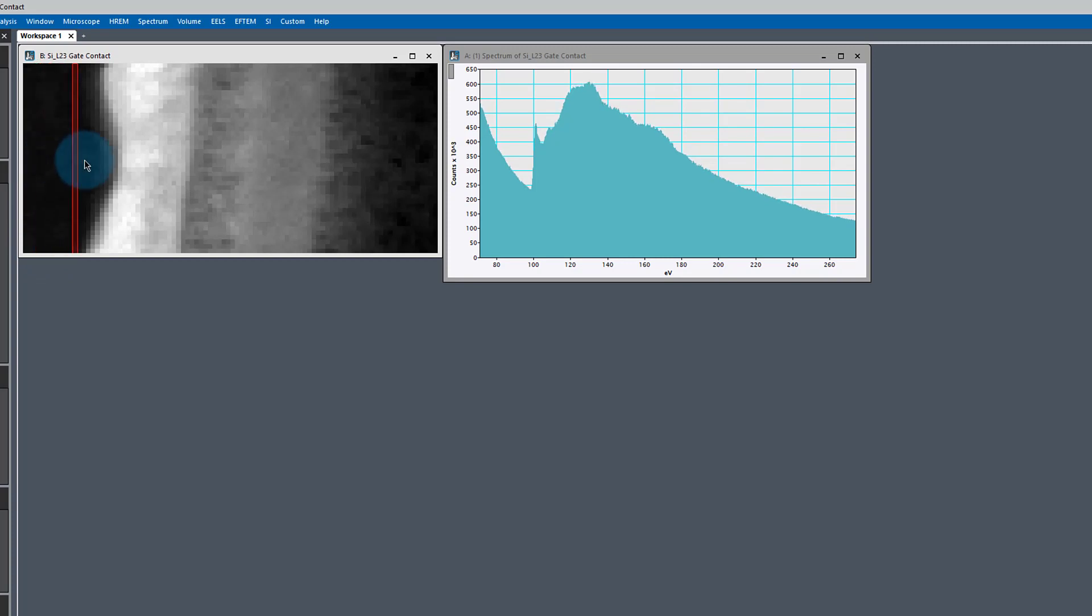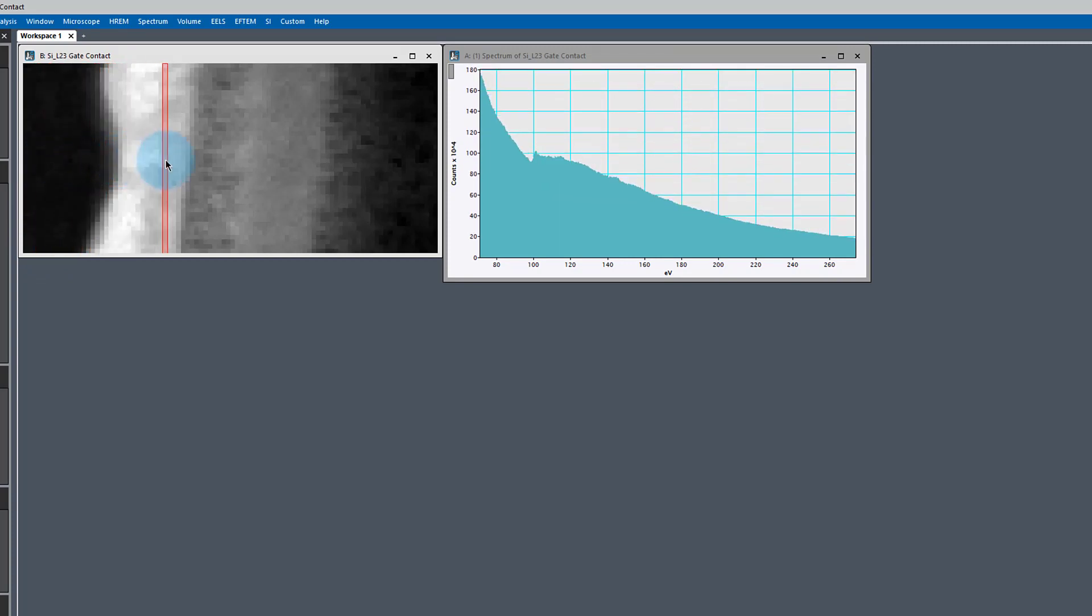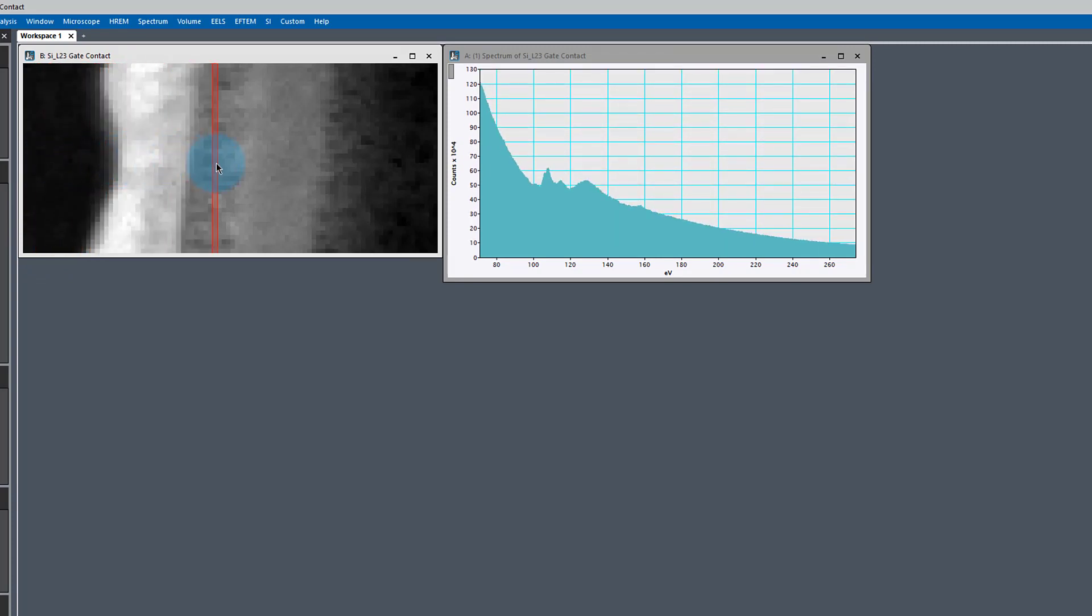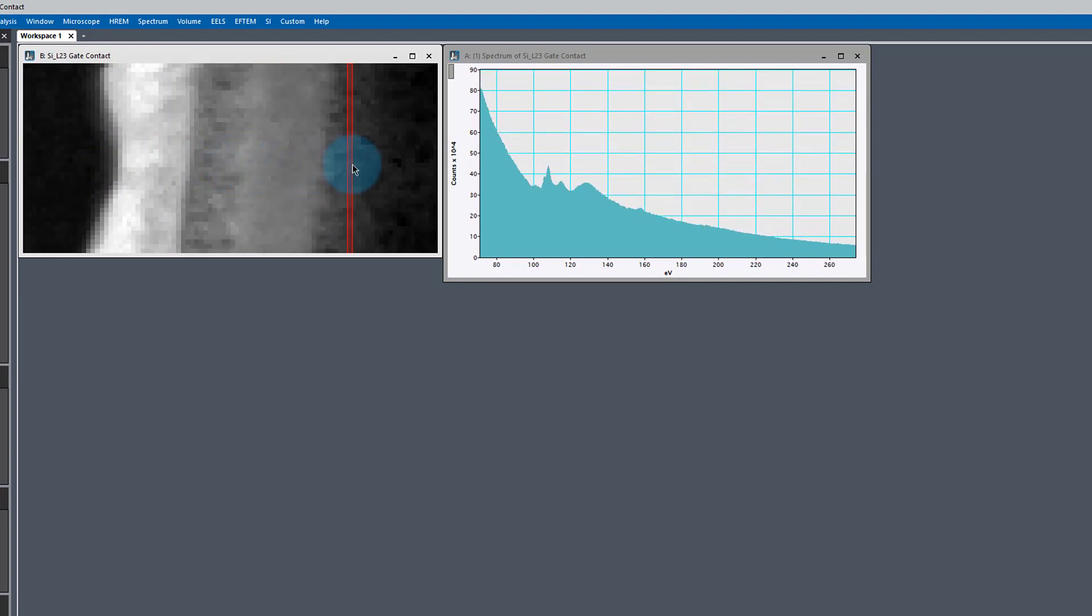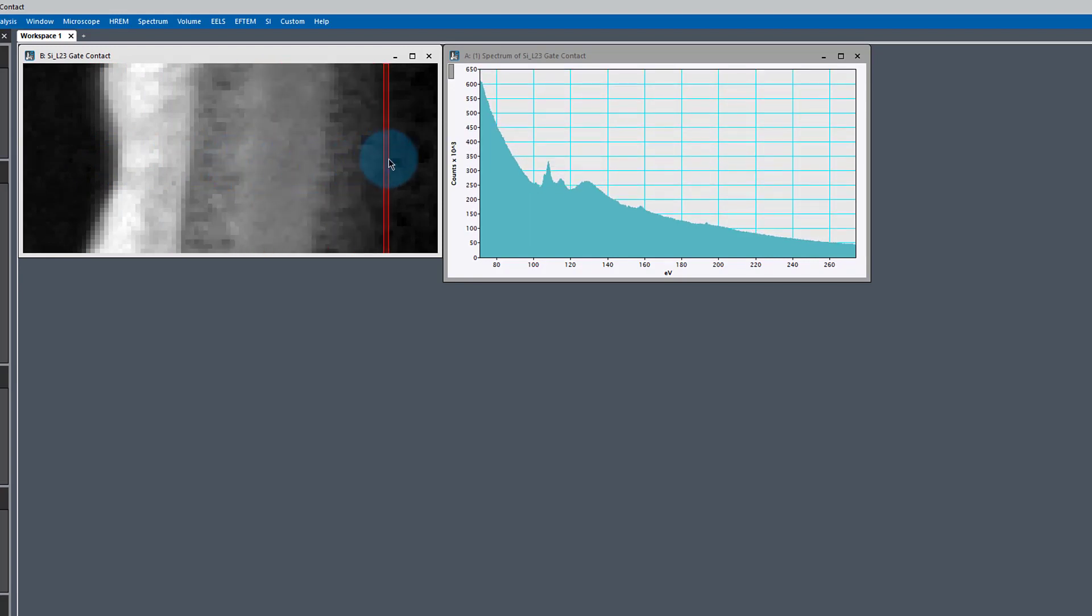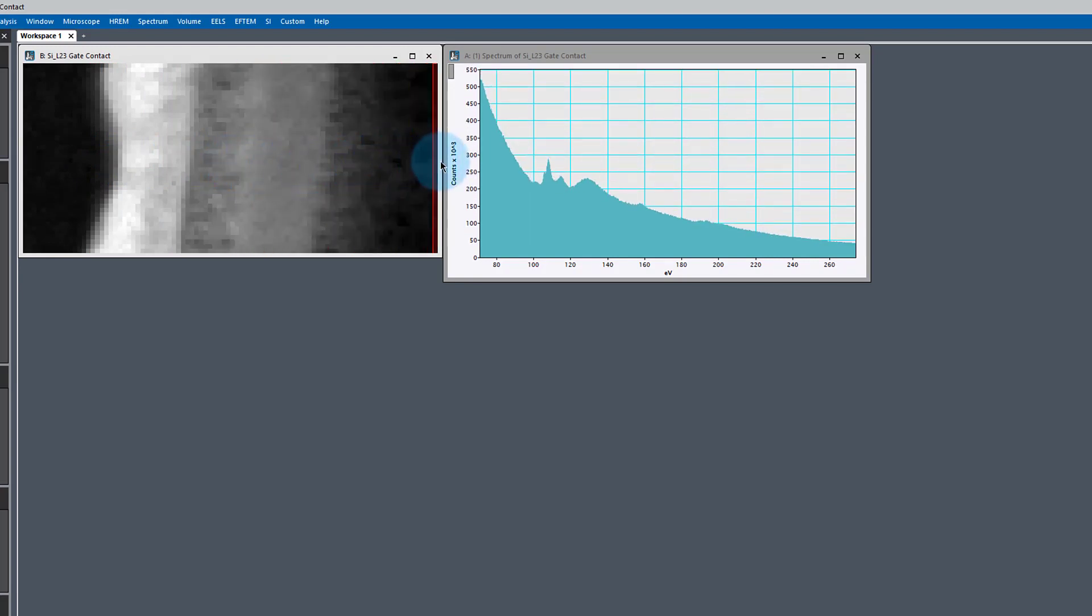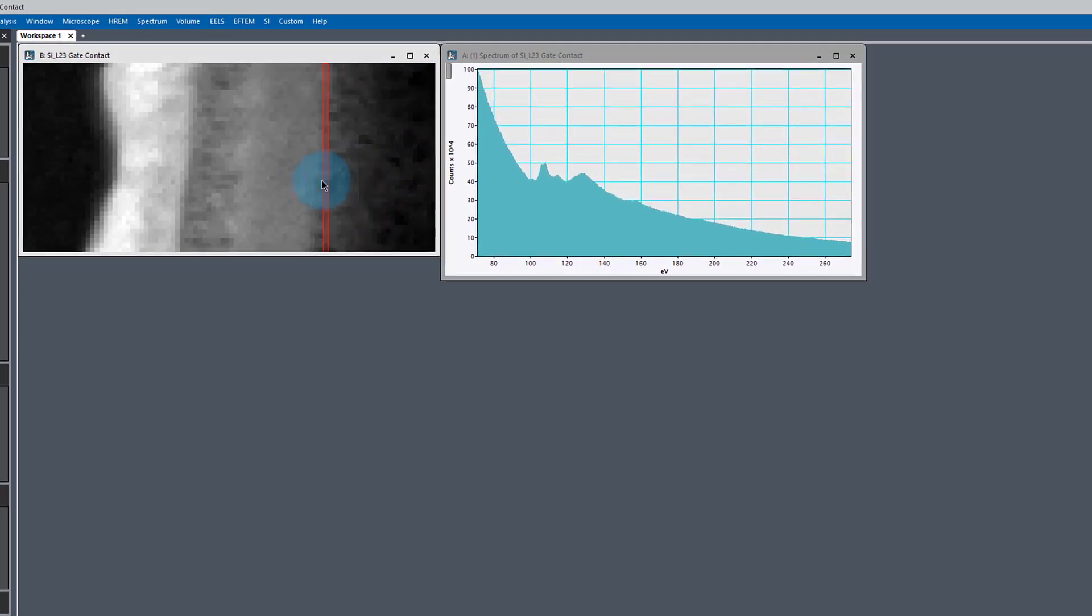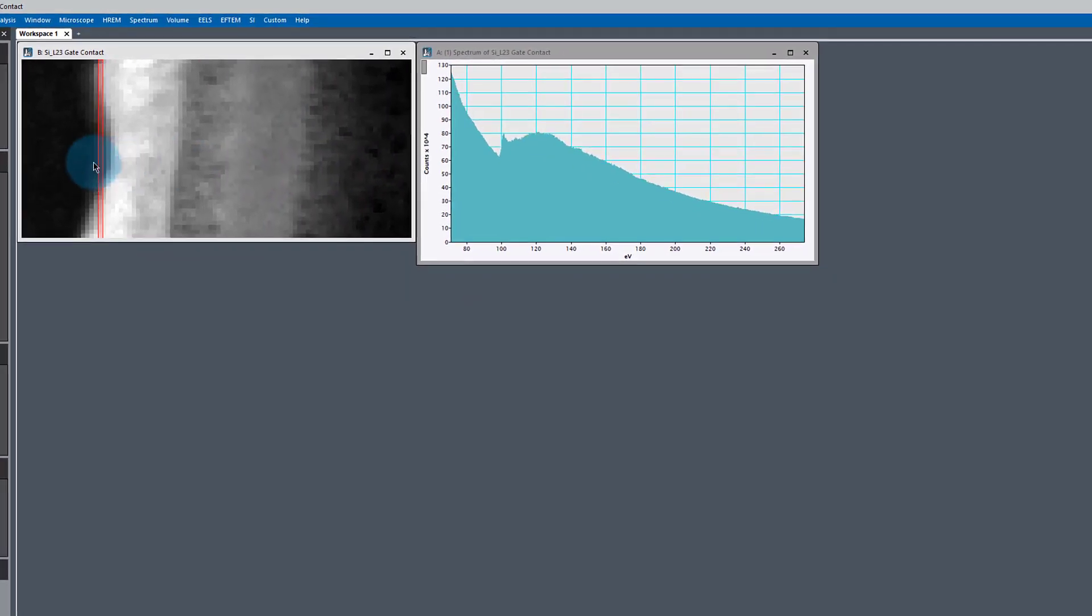As we scan through the data, we see that L23 edge changes quite dramatically, and we can use that change to map out the different chemical phases of silicon.